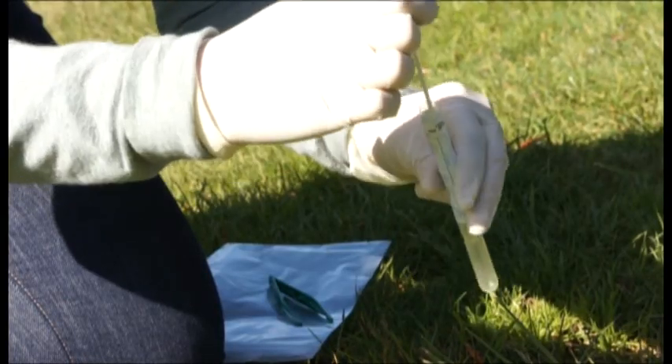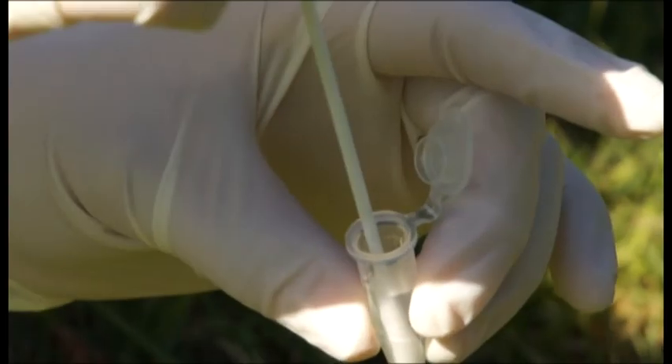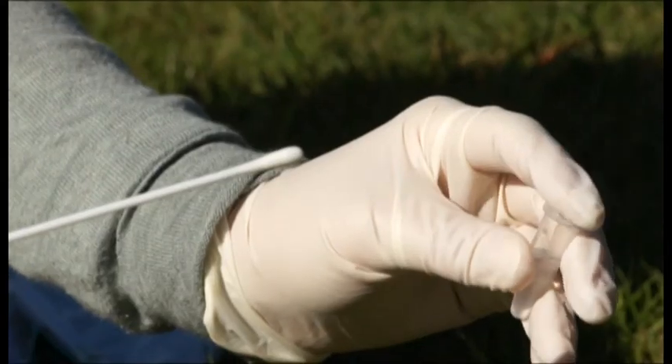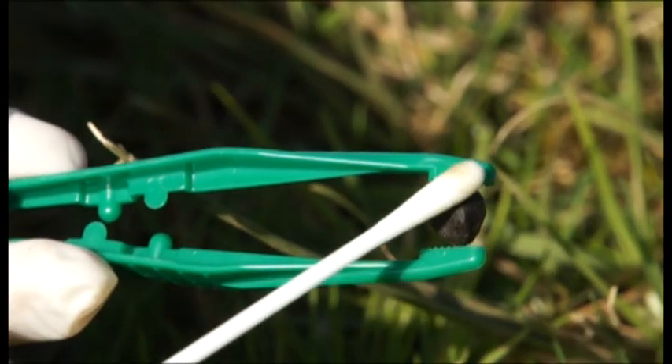Remove the sterile swab from its protective case. Submerge the clean swab into preservation buffer once before swabbing and close the lid. Gently wipe the entire surface of three different palettes from the same pile with each swab.